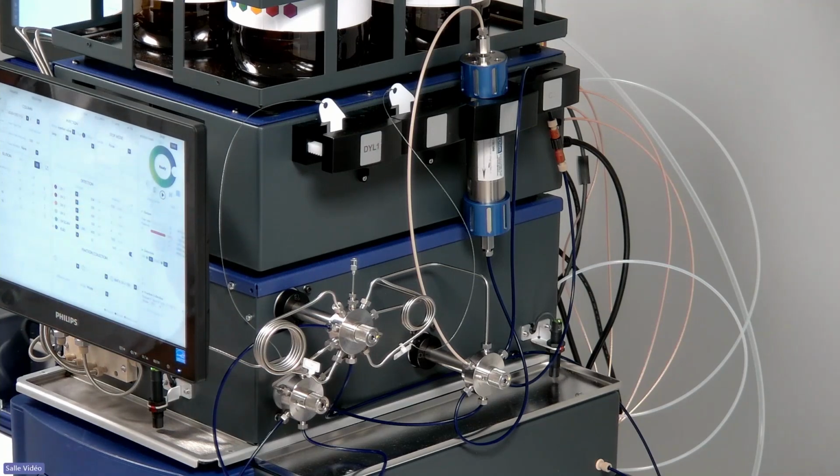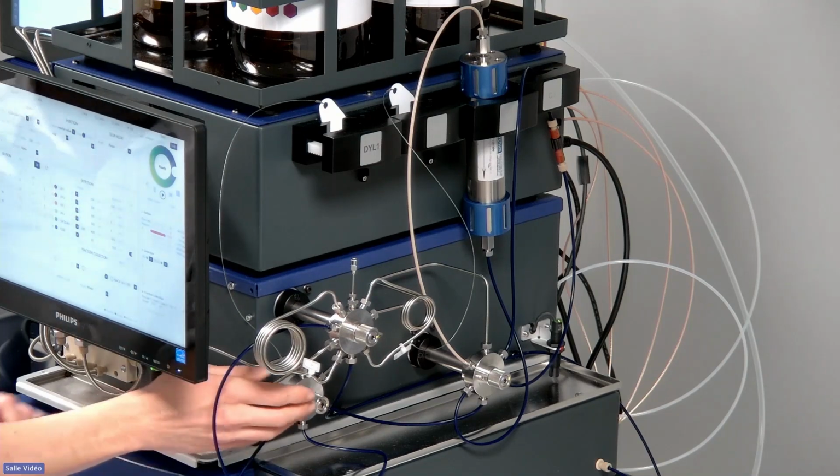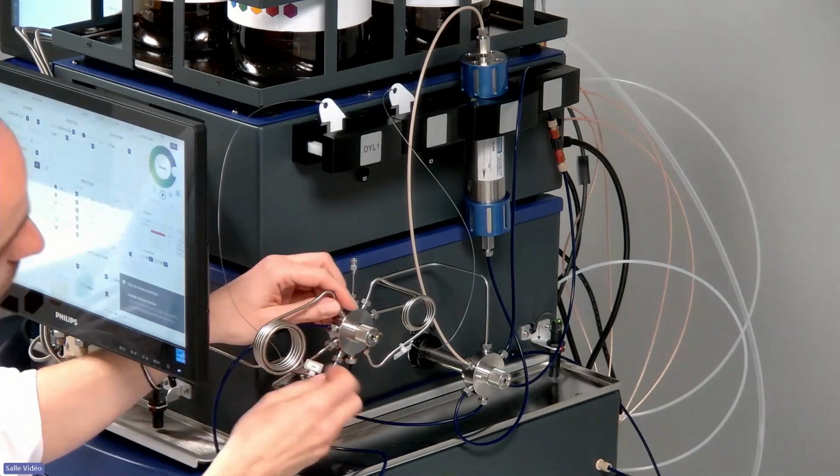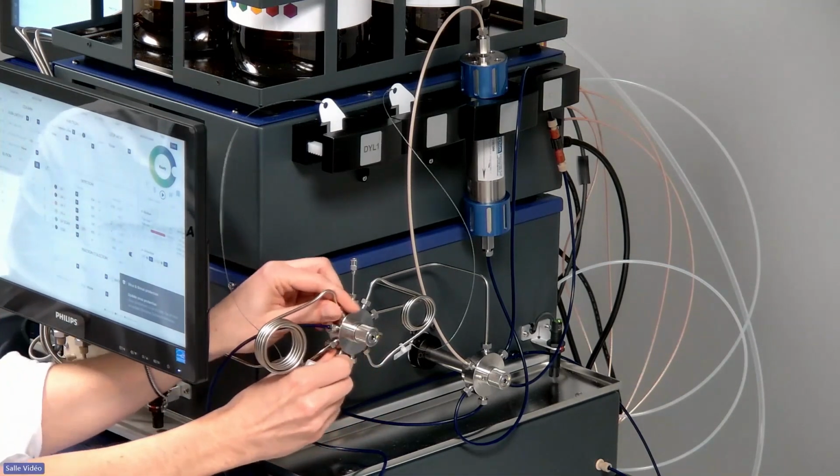You can also replace the loop by a dry load to manage this time direct injection with the dry loads. So you just have to remove the loop. So for example, I will remove loop number 1.